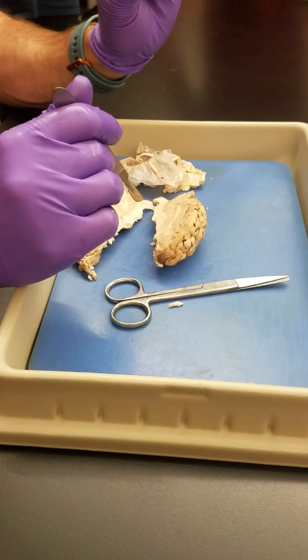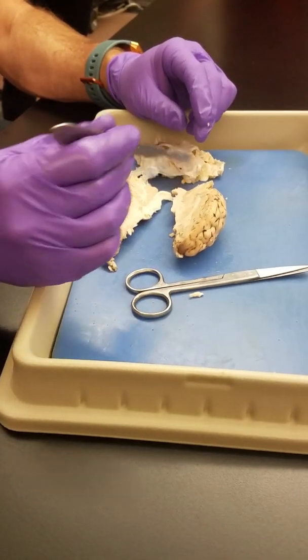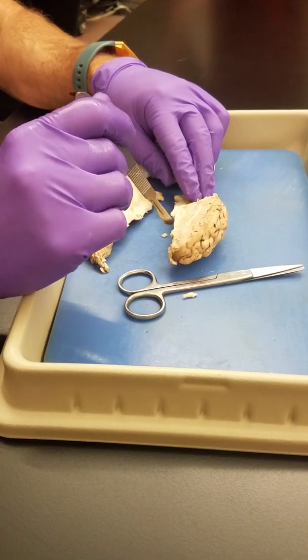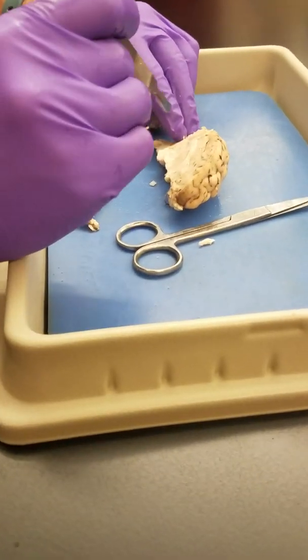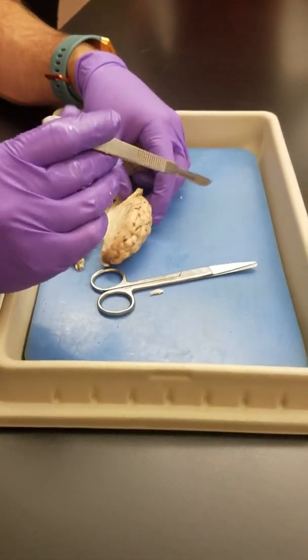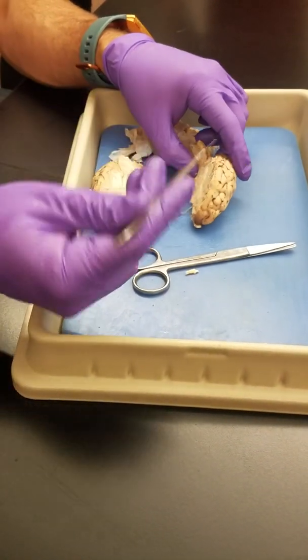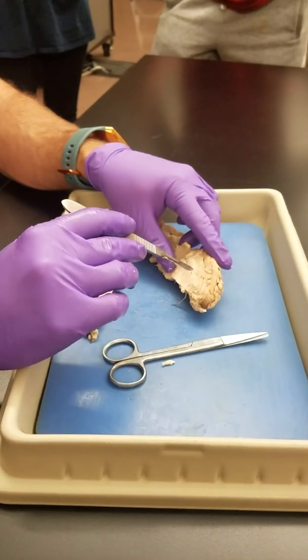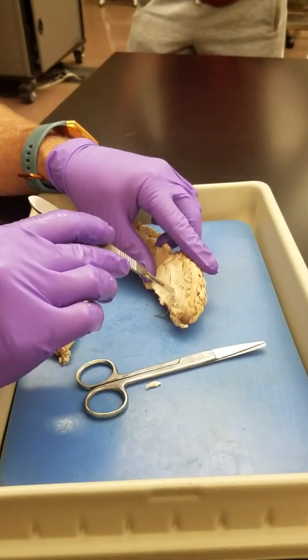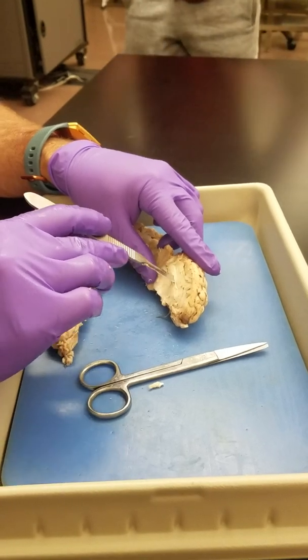Who was talking about Phineas Gage? So there's all things here. Here at the bottom, these are called the cerebral peduncles. Right? They mean little feet. And here are the superior and inferior colliculi. We also have ventricles. The ventricles are where the cerebral spinal fluid is made. And between here, we have what are called the lateral ventricles.